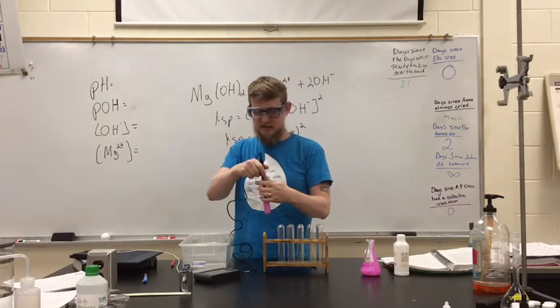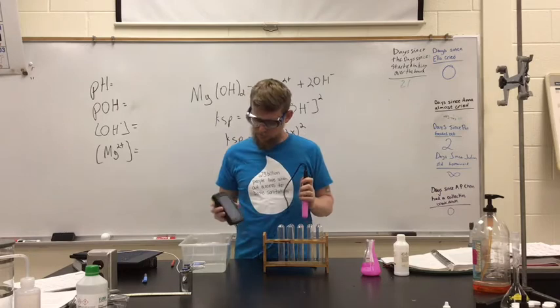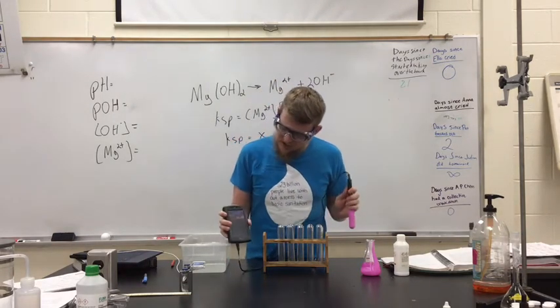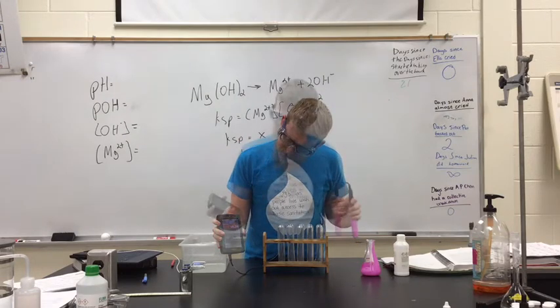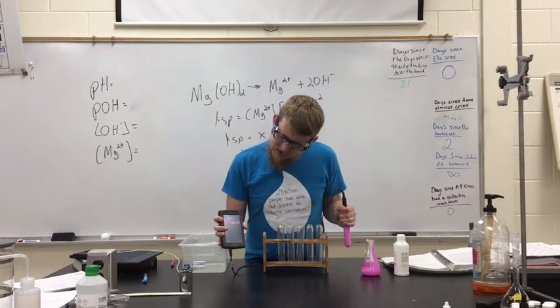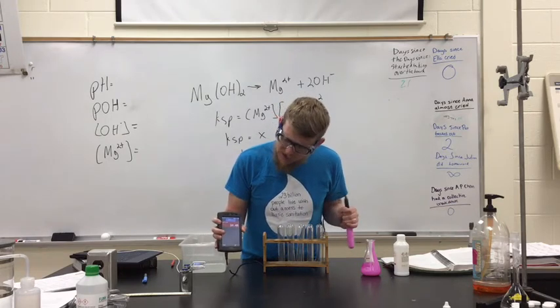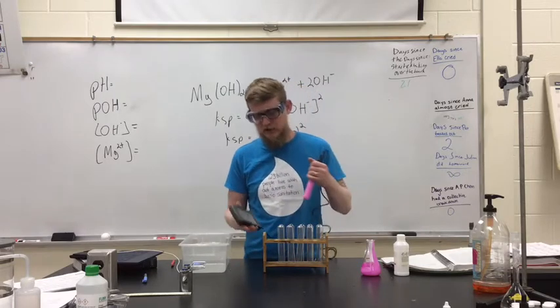So we're going to stick this pH probe in. We've got our pH meter going here. We're going to just give it a few minutes. You can see, I hope, that we're a little bit above 10. All right, guys, it seems like it's pretty much at equilibrium here at about 10.49. It's not changing very much. Oh, there it goes. Change to 10.5. We'll use that. If it is changing at all right now, it's changing very, very slowly.